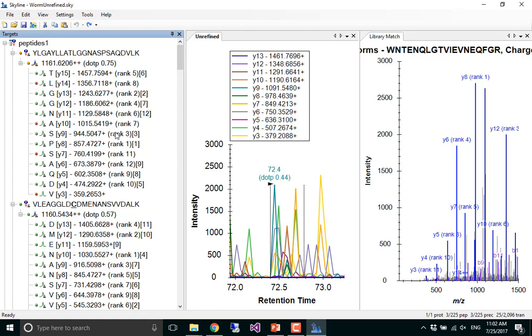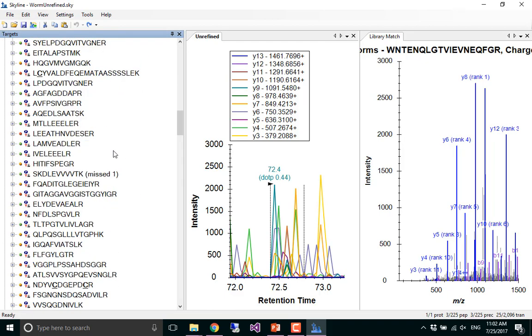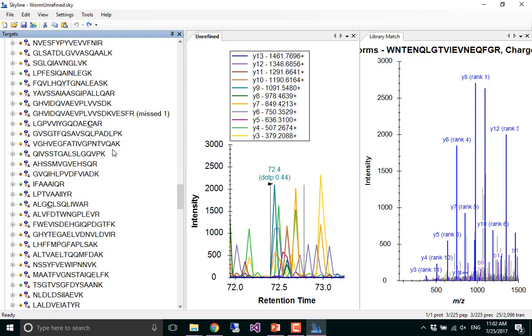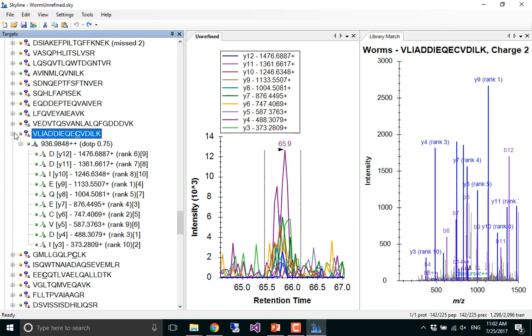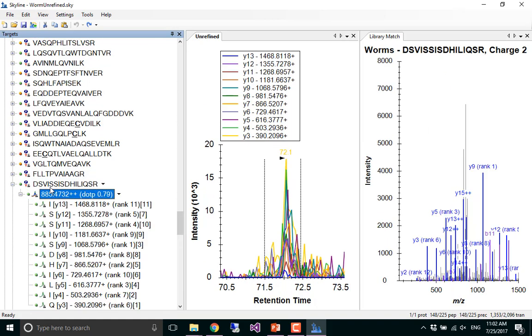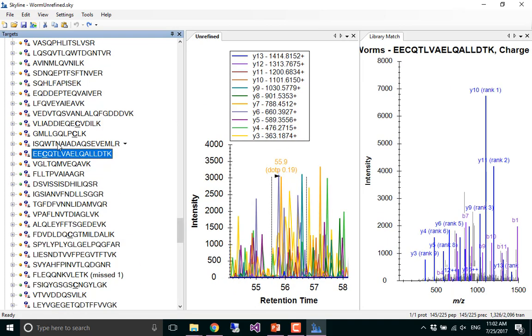These little red dots were designed for being in this refinement mode where we're going, okay, what do I think I detected? And you can scan down this list and you can already get a sense of, well, there are some green ones, those are probably okay. Well, that's not even that great. But a lot of the green ones are going to be real detections. And a lot of the red ones are going to be garbage.